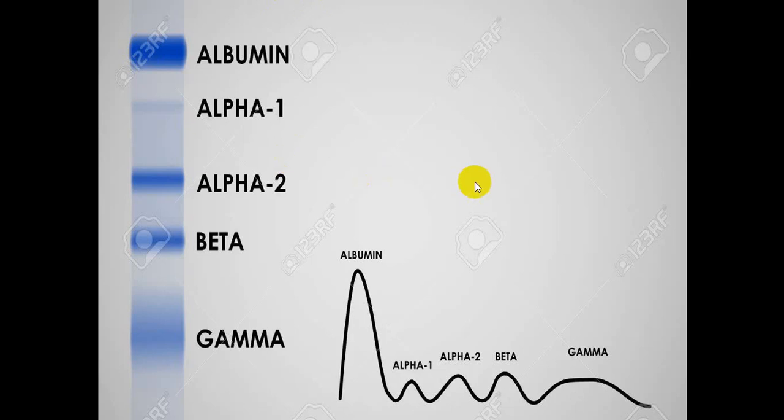So we assume we don't know where the migration is from, but we just look at the concentration. You see that this one is very thick and deep colored, so you can say it has the biggest proportion. It's not weight or mass or size, but it has the largest percentage among all these 5 components.